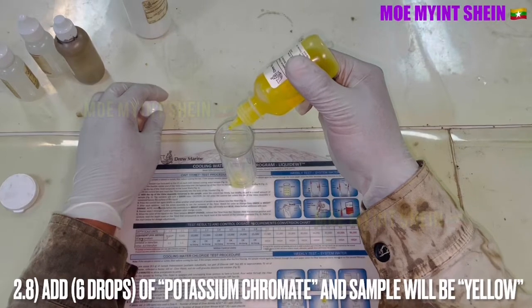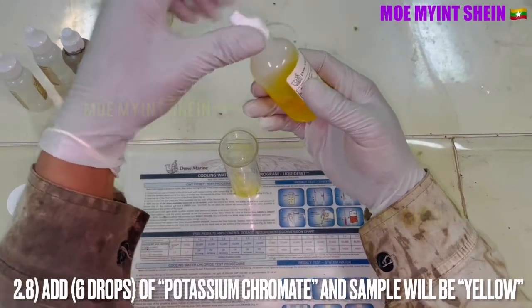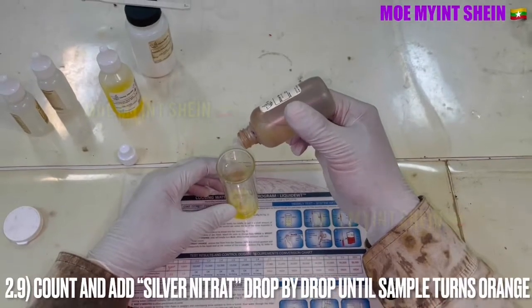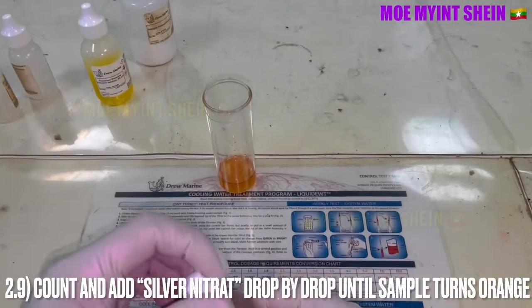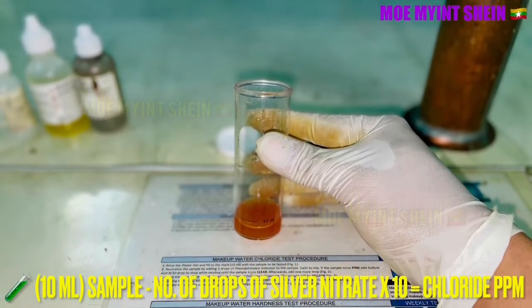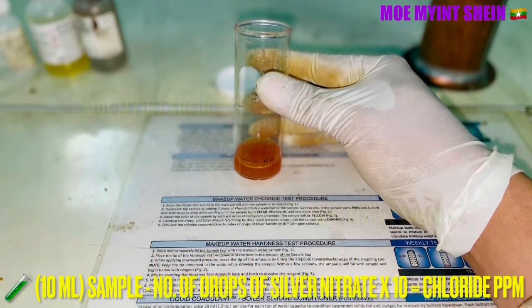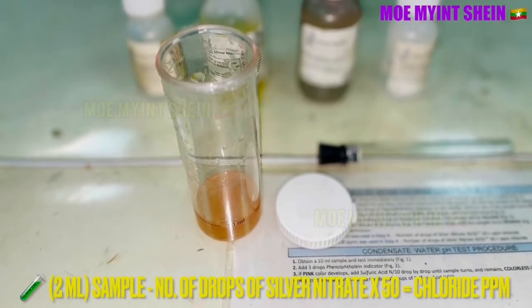After that, add 6 drops of potassium chromate — the sample will turn yellow. Count and add silver nitrate drop by drop until the sample turns orange. Chloride ppm can be calculated by multiplying the number of drops of silver nitrate by 10. This is for a 10 milliliter sample. For a 2 milliliter sample, multiply by 50 instead of 10.